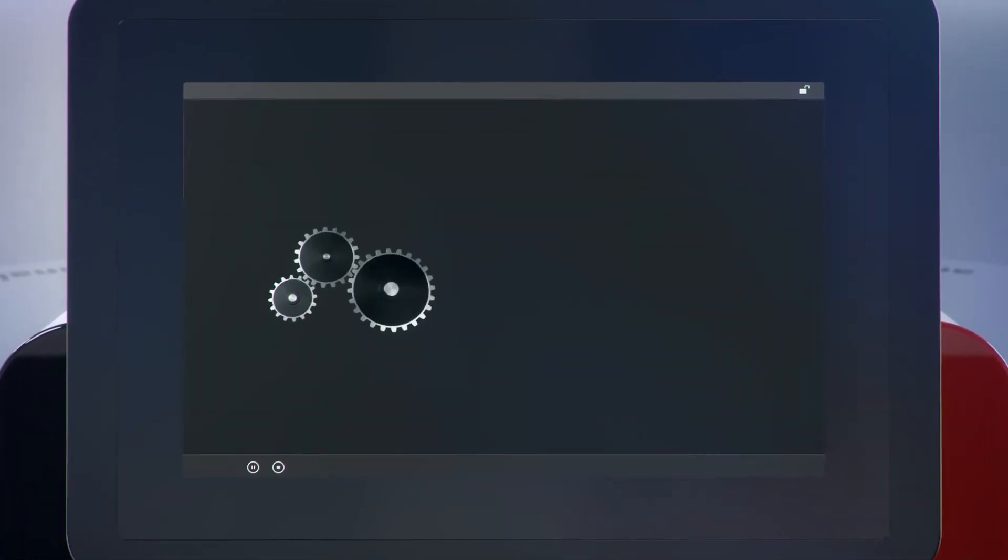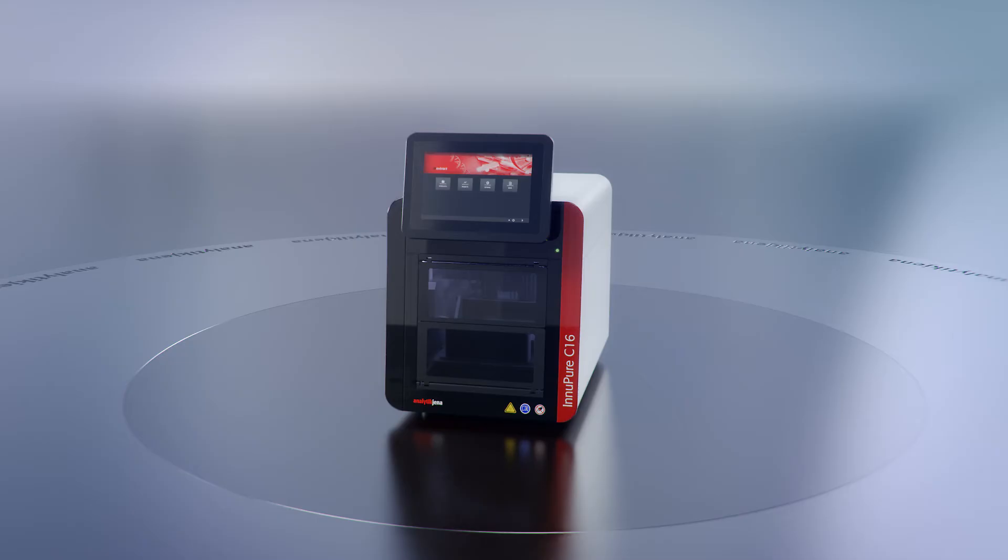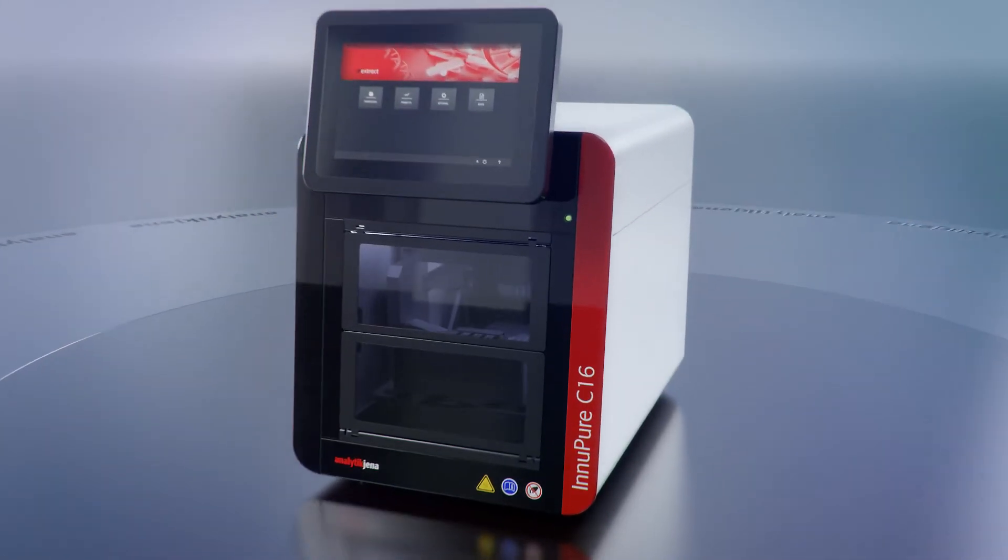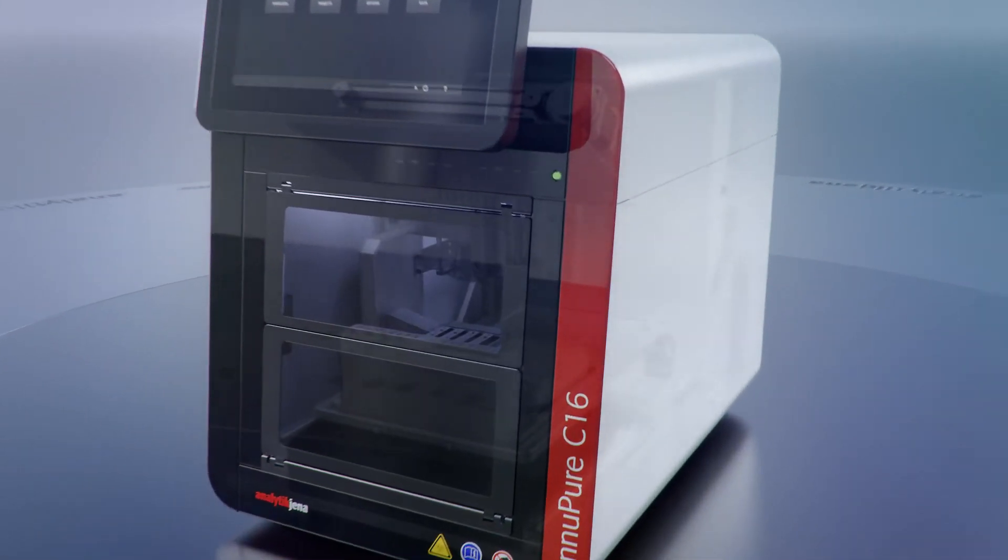Another key feature is the large color touchscreen, which always shows an up-to-date overview of the current steps.